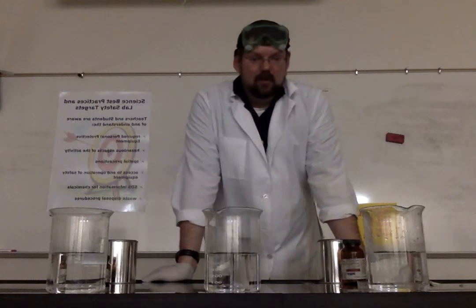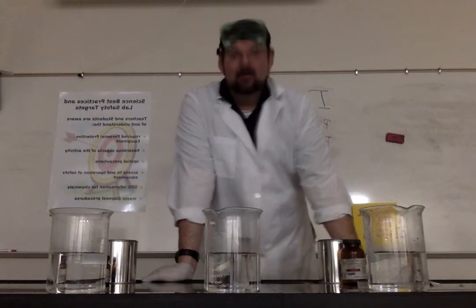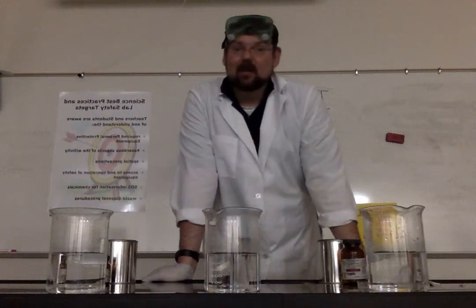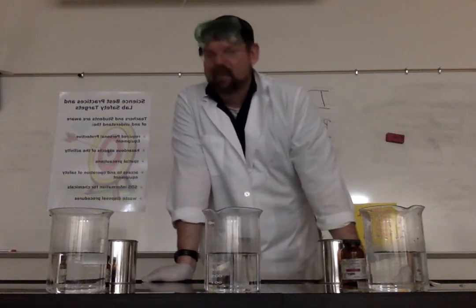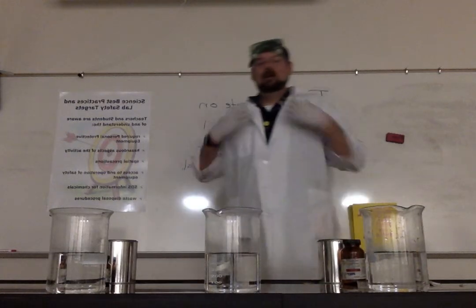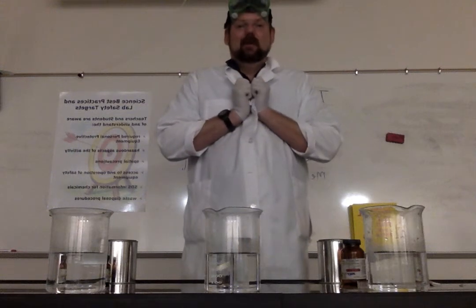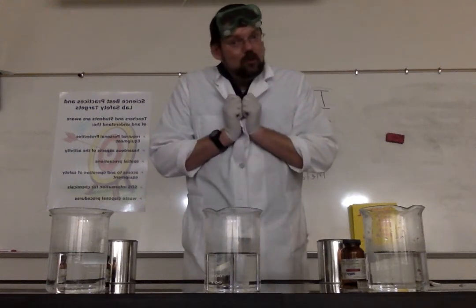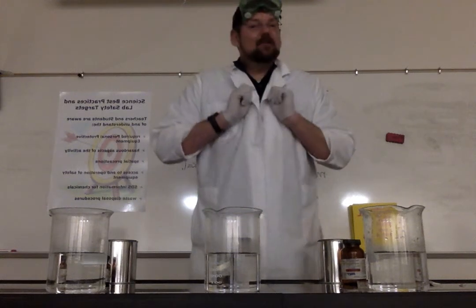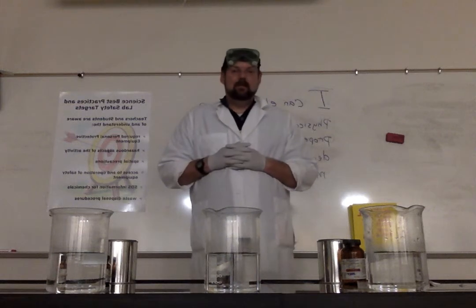If I'm not protecting my eyes, then I'm not doing myself a very good service. Okay, we're very visual creatures. If something gets into my eye, I can lose my vision. I want to use the goggles, even though you may say, hey, they're not the best looking things in the world. They leave marks on my head. We still want to use the goggles. Okay. Also, I'm wearing, I hope, a non-flammable lab coat. I don't want to find out if it's true or not, but the manufacturer label says that it is. It's just an extra layer of protection in case something does land on me and I don't get burned.